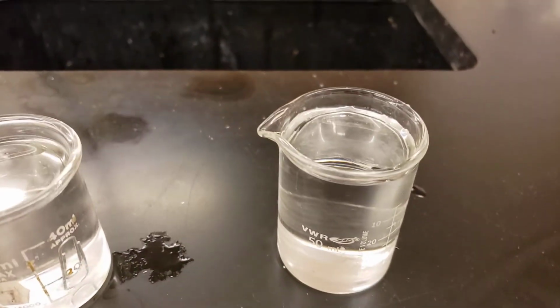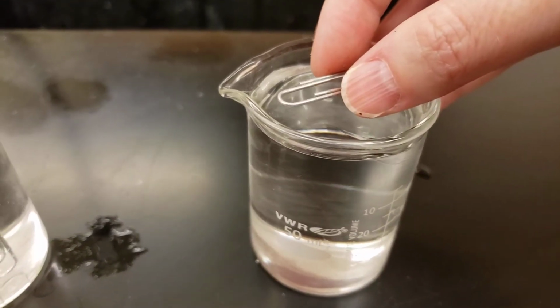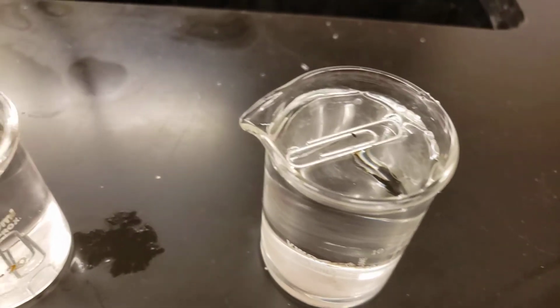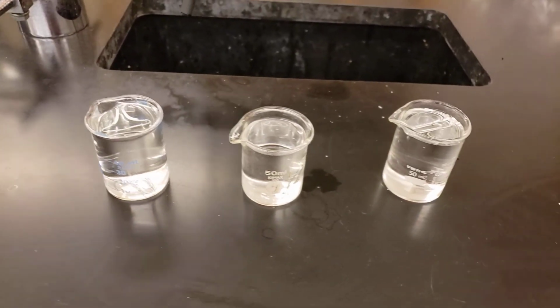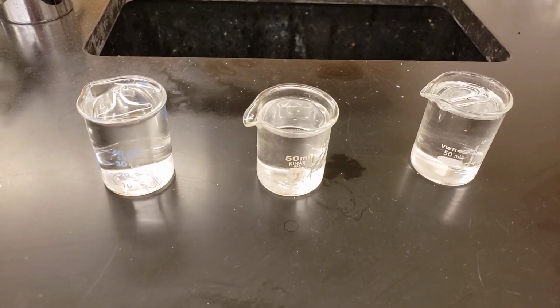And last up, we are going to do our glycerin. We're going to try and float that one in there. And we can see that the paper clip is actually able to float on top of the glycerin and does not sink at all. All right, using the data that we have gathered in these 3 lab activities, answer your questions.